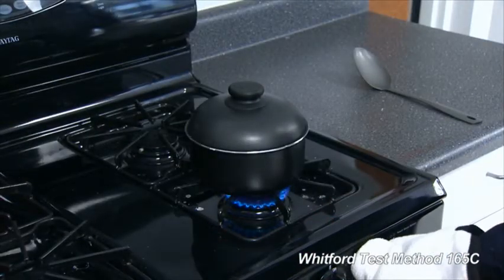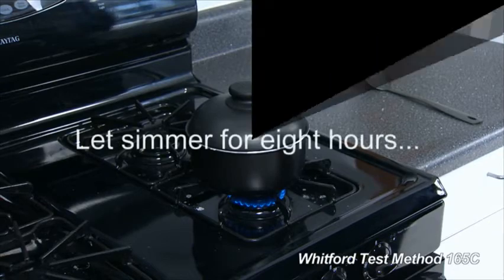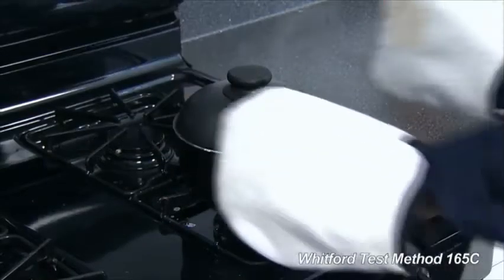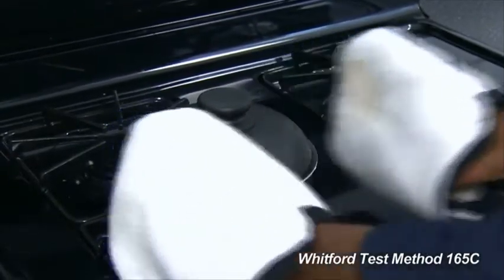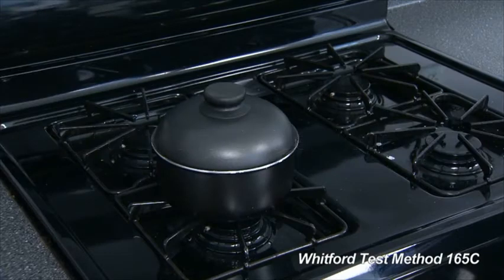Reduce the heat and let the salt water simmer for 8 hours. Remove the pan from the heat and let it stand with the salt water in it for 16 hours. 24 hours completes one test cycle.